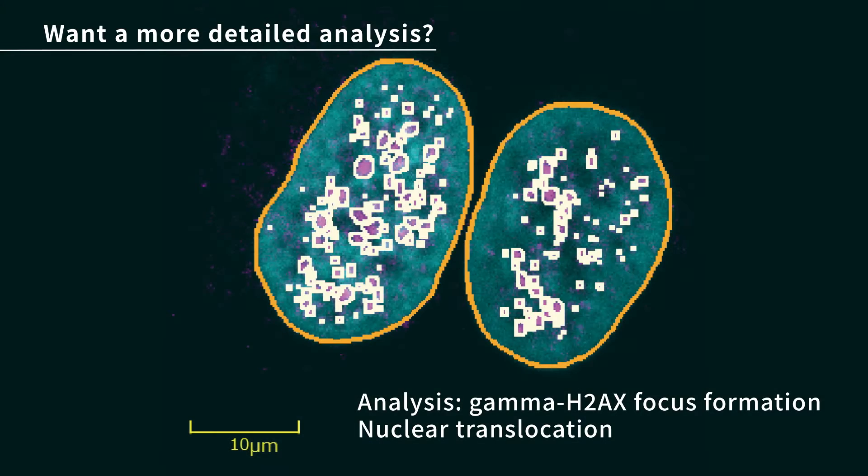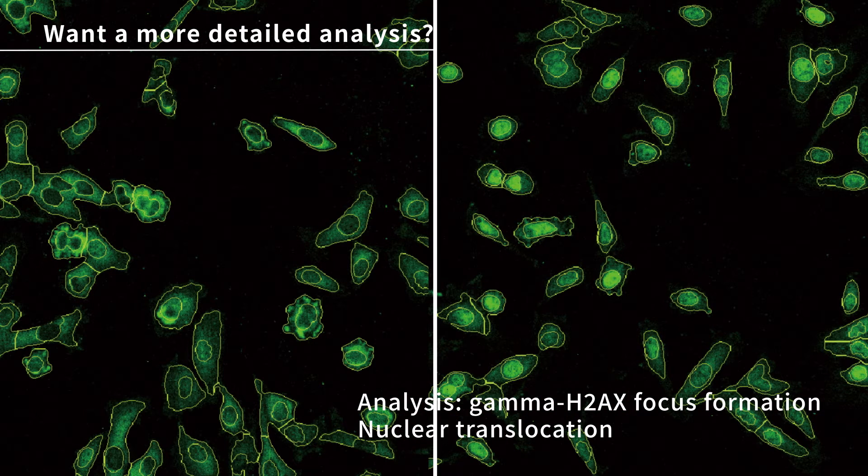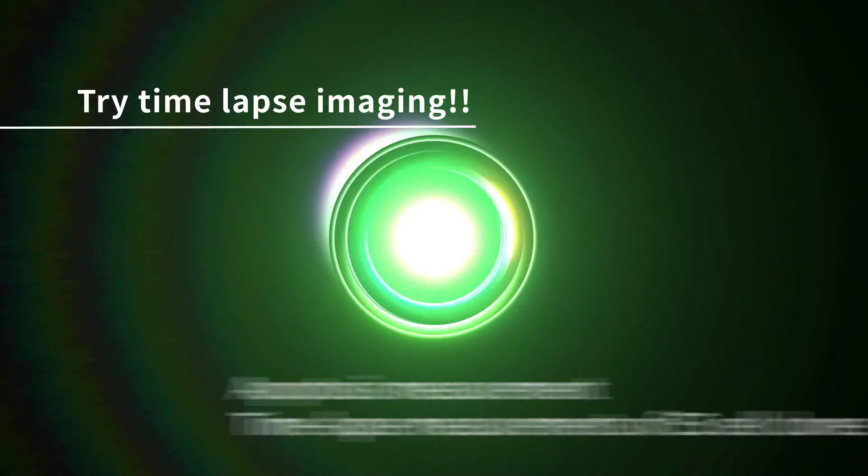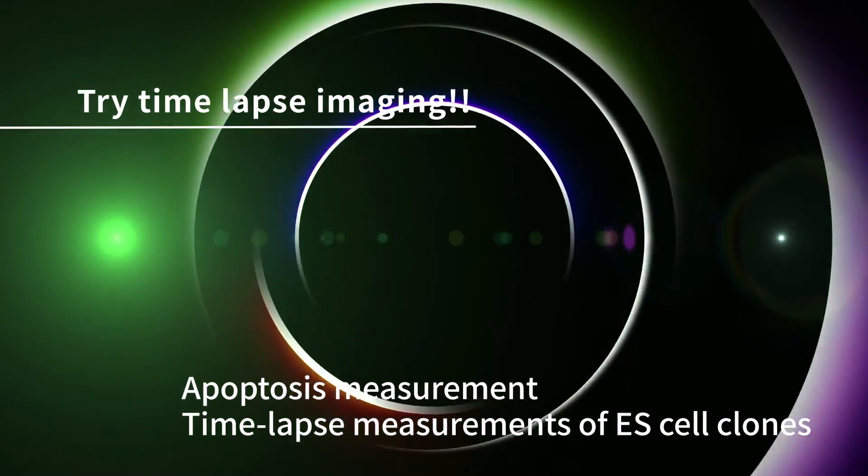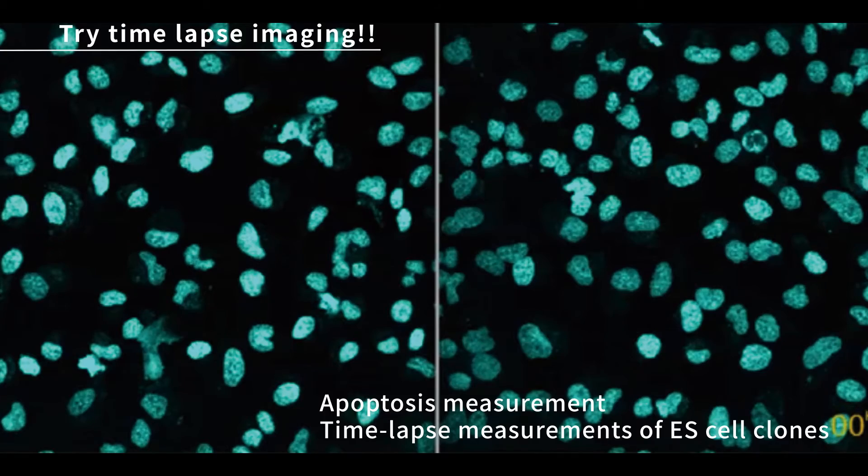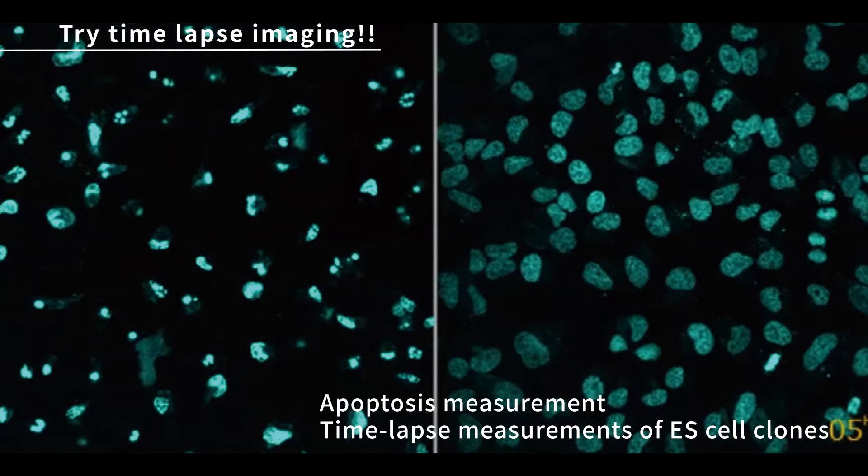Cell Voyager CQ1 can be integrated with other cell culture equipment and plate transfer robots to build a complete imaging system that automates the entire process from culture to imaging and analysis.